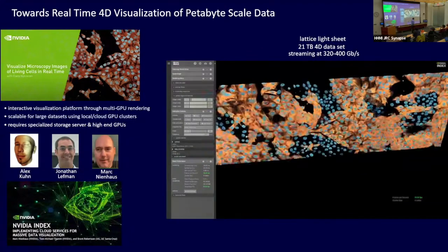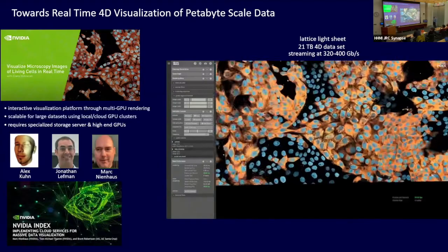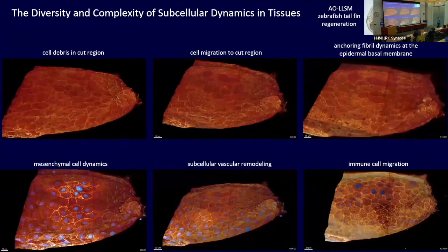So again, just in real time, as you get the data, you can then manipulate the data. You can do slices through the data. You can follow time courses, zoom in, and so forth. And so that's still a bit of a work in progress, but it's developing. And all my movies are starting to slow down.